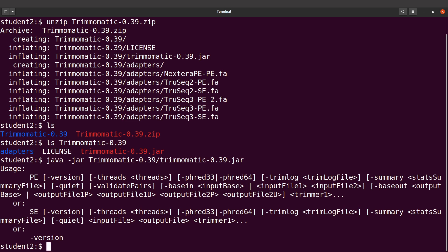After setting up Trimmomatic, what you have to do is run Trimmomatic to trim your reads, and I have a tutorial on that. Check the description box — you'll find a link to one of those videos. You can also check the video shown right now, which shows how to trim reads using Trimmomatic.